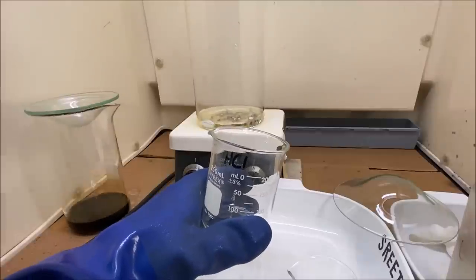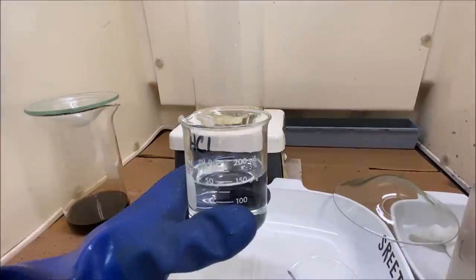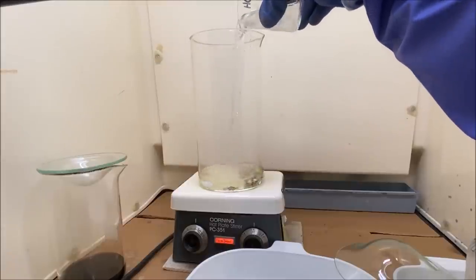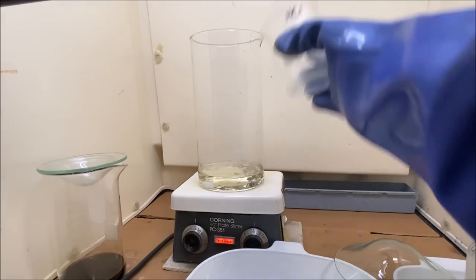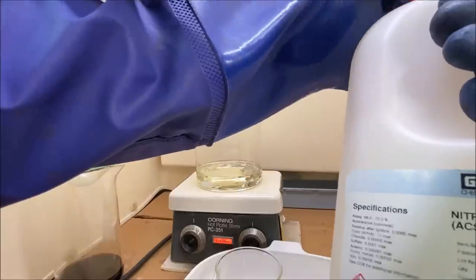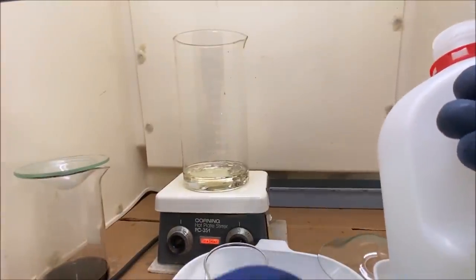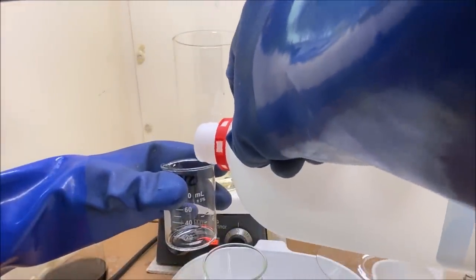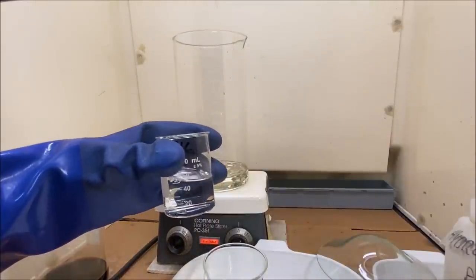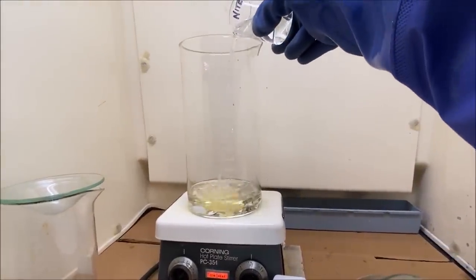I'm gonna put a little bit more hydrochloric acid into the reaction. That's about 150 milliliters. Just gonna add that right in. Do is add a little bit more nitric acid. Just gonna add some in with this beaker, about 50 milliliters, I guess. I'm just gonna dump that right on in now and continue with this reaction, trying to get the rest of that platinum to go in solution.